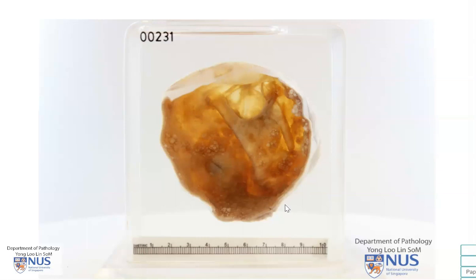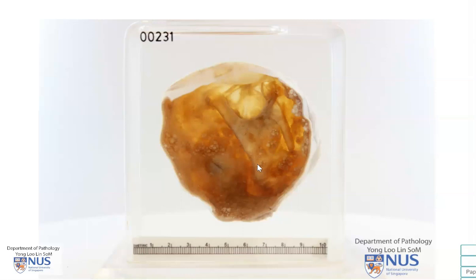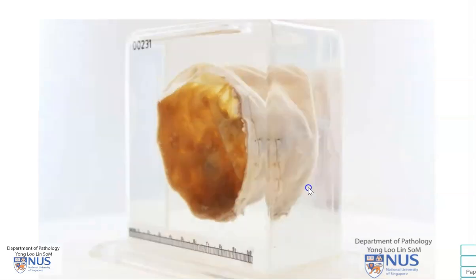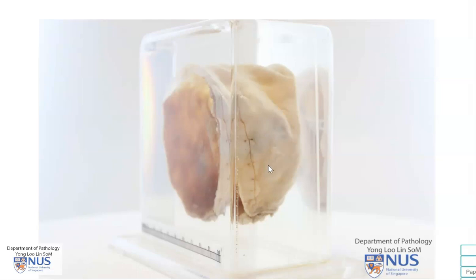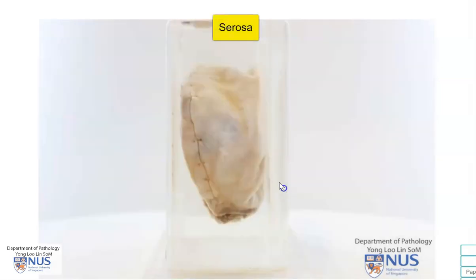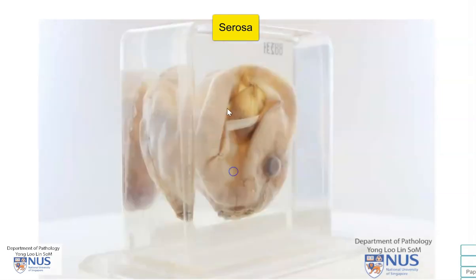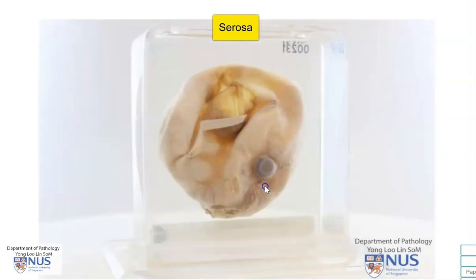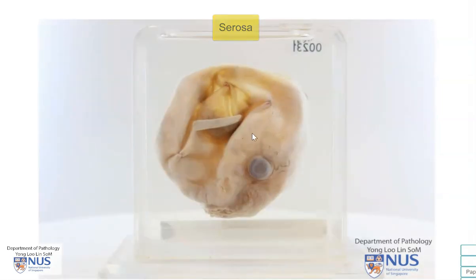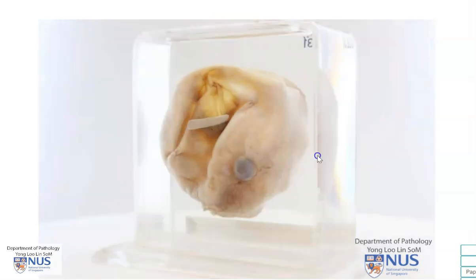Hello, we're looking at a pathology specimen of an enlarged cystic ovary, and what we're looking at here is the inner lining or the inner wall of the cyst. Let me just turn the specimen around. This is the capsular surface or the serosal surface, and I want you to observe that the serosal surface is actually very smooth. There is no evidence of any tumor deposits or any masses on the serosal surface.